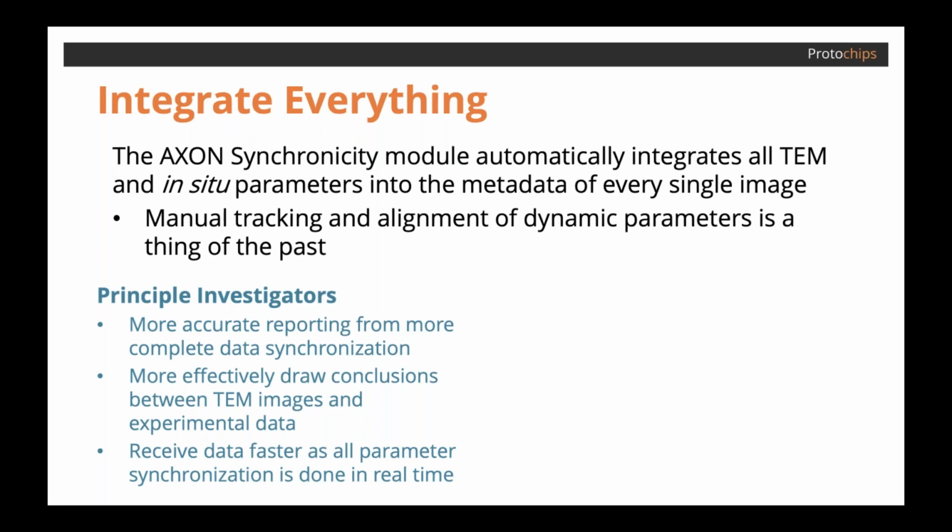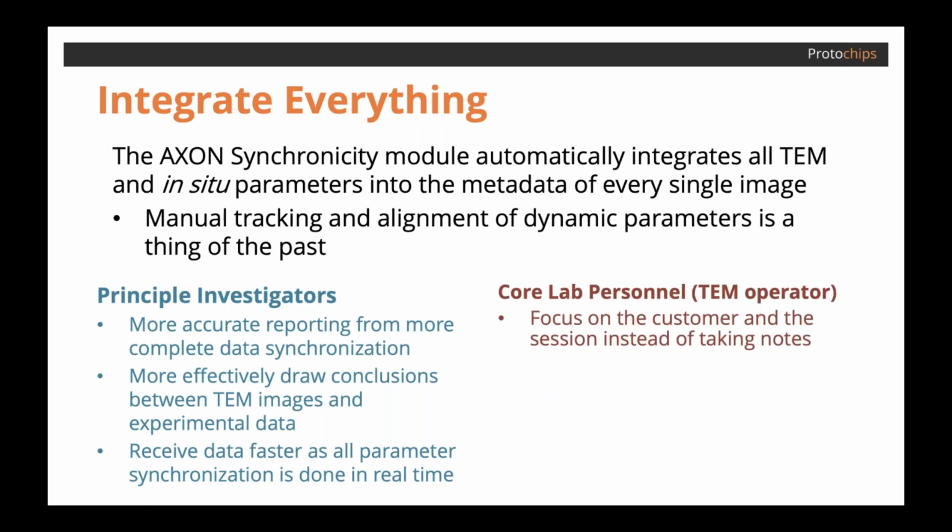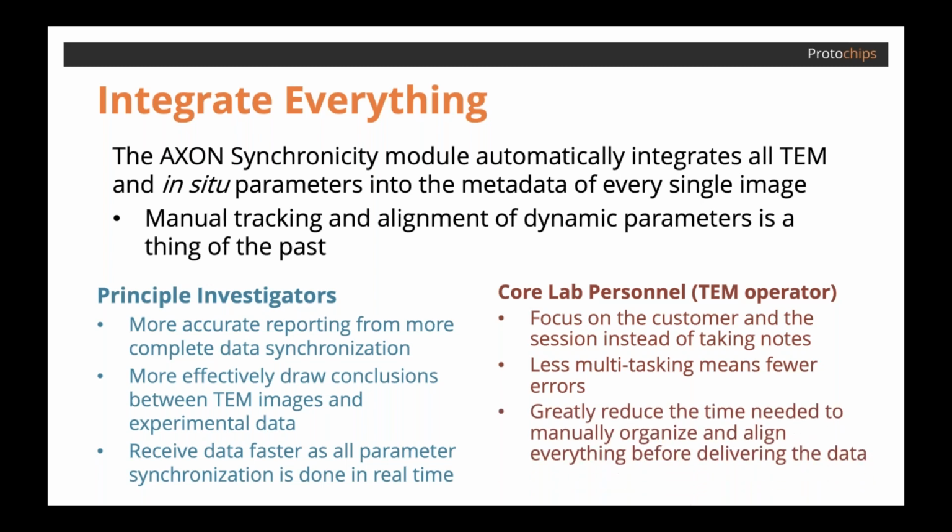From a core lab personnel perspective, you can focus on the customer and the session instead of taking notes. There's less multitasking, which of course means fewer human errors. And you greatly reduce the time that's required for manually organizing and aligning all of the data and parameters before delivering it to your customer. And by greatly reduce, I mean you eliminate it.